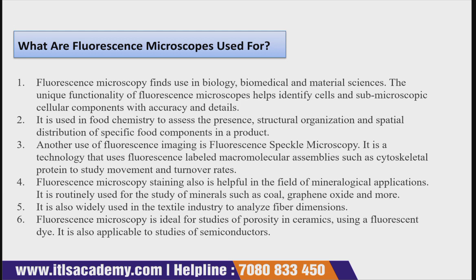Another use of fluorescence imaging is fluorescence speckle microscopy. This is very important. This technology uses fluorescence-labeled macromolecular assemblies such as cytoskeletal proteins to study movement and turnover rate. Fluorescence microscopy staining is also helpful in mineralogical applications.